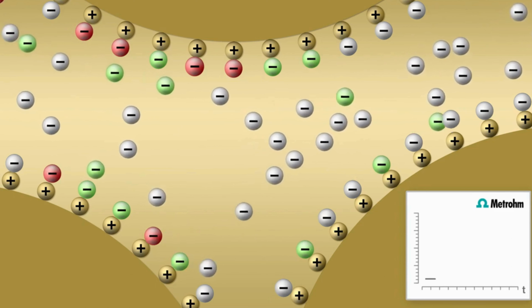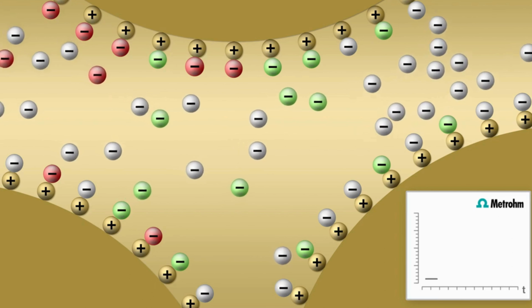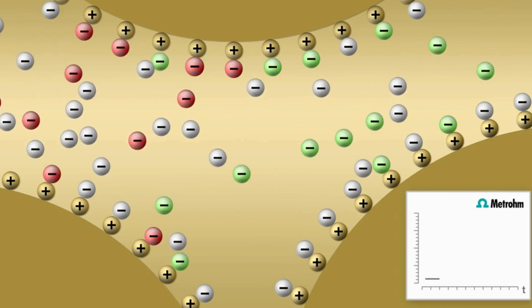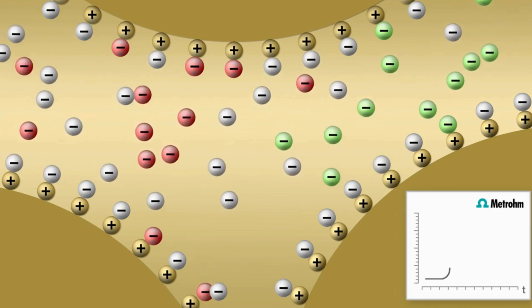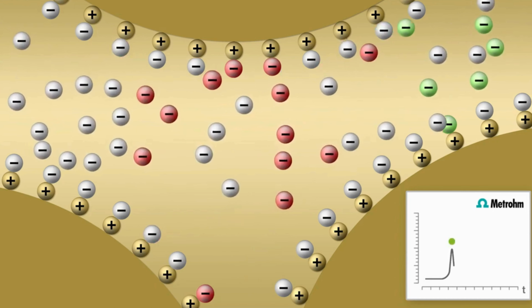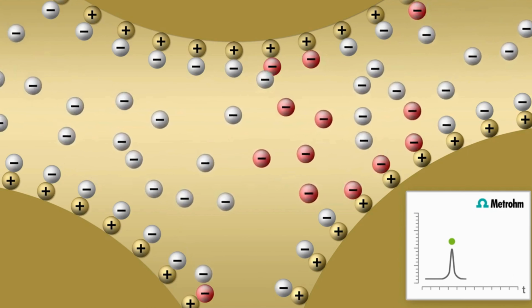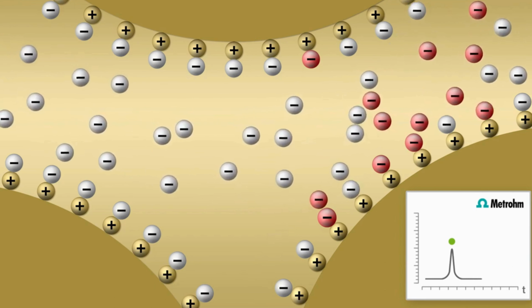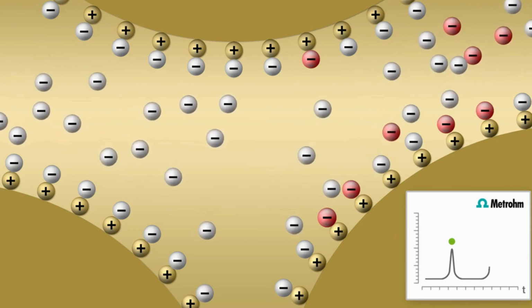The underlying ion exchange resin is not consumed chemically during normal operation. Rather, it provides an insoluble polymeric matrix containing fixed ionic sites and mobile counterions. The user's supplied text describes these resins as cross-linked three-dimensional polymers, most commonly based on styrene divinylbenzene, PSDVB, with functional groups such as sulfonic acid and quaternary ammonium groups introduced after polymer formation.